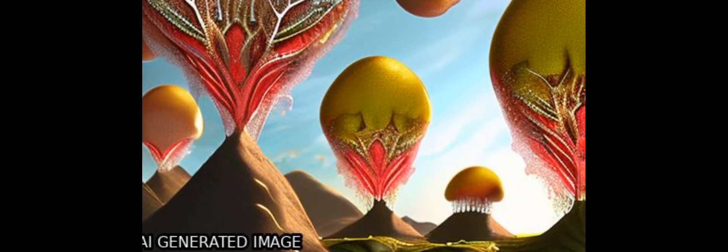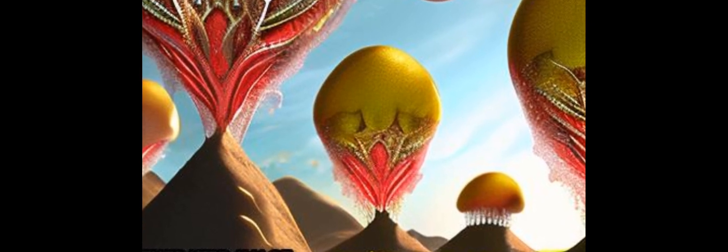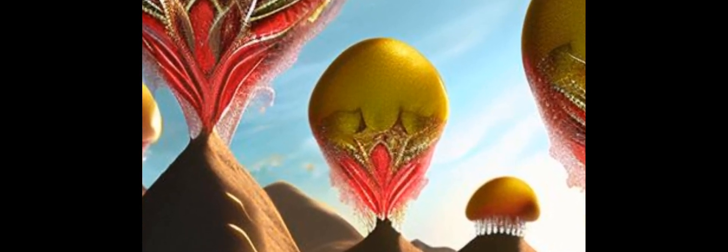The crystallite size of the cerium oxide nanoceria was determined to be 28.09 nanometers, and the EDX analysis confirmed the presence of gold.